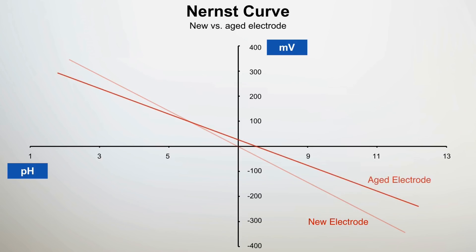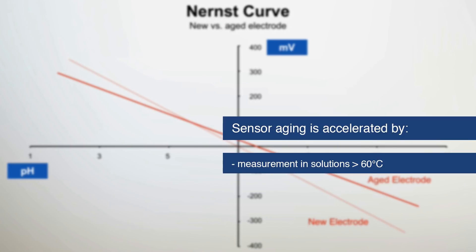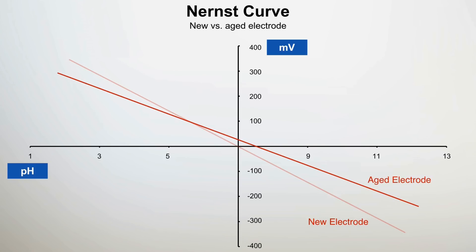As aging occurs, the sensor response time to changes in pH gets slower. Aging is accelerated by certain factors such as continuous measurement at elevated temperature, exposure to strong acid or alkaline solutions, and poor maintenance of the pH electrode outside of the process — for example, during cleaning or storage. Besides poor handling and storage practices, other sources of error can be compensated within certain limits by ongoing maintenance actions such as proper cleaning and recalibration.